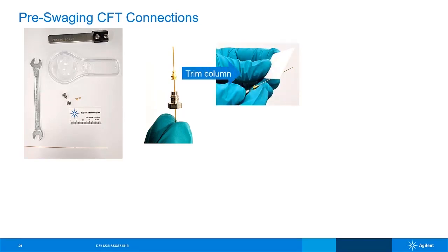Next, you'll trim the column and inspect the cut. The cut should be straight across and free of burrs or any cracks.